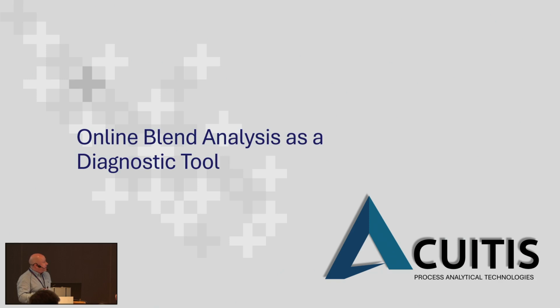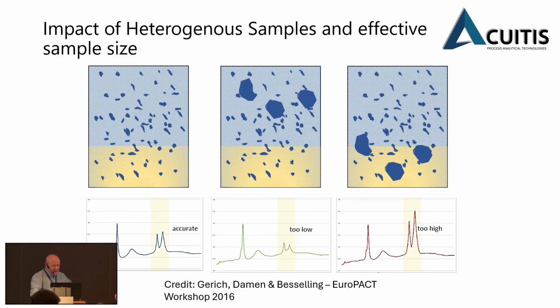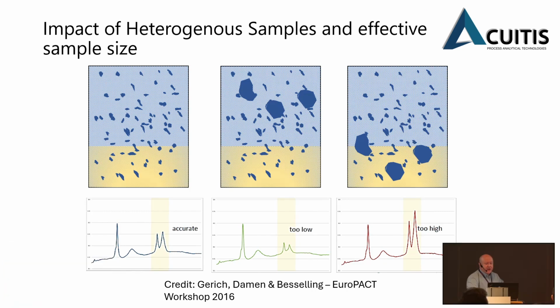So on to how we can use online blend analysis as a diagnostic tool. An important consideration with near-infrared spectroscopy is the depth of penetration of the radiation itself. And we've got two things to contend with here. One is the fact that near-infrared absorption increases with wavelength.